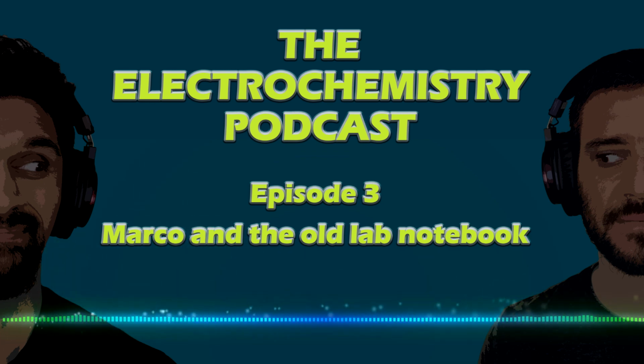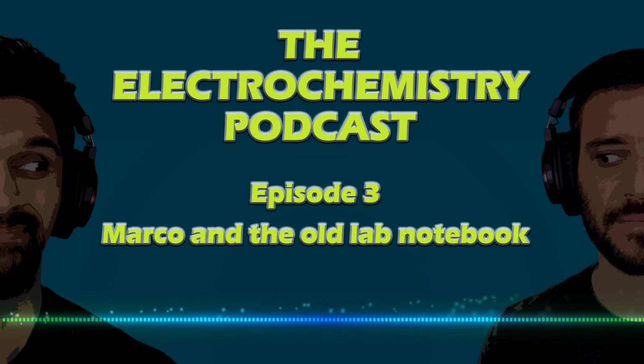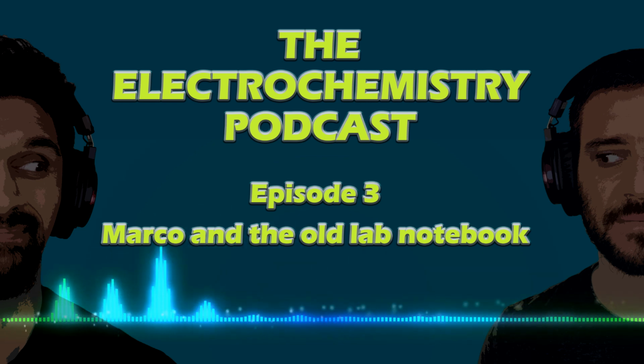Okay, so right away here, I think I see a problem. So you said Marco tried to apply down to minus 2 volts? Correct. Yeah, so that's going to be a problem. So you see, when you're doing electrochemistry, you need to be aware of constraints with your solvent. So first of all, if you're using water, like in an aqueous system like Marco here, you've got a window of maybe 1 to 2 volts total. It depends on the pH and the reference electrode and things like that, but something like minus 1 to plus 1 volts, something in that area. But generally speaking, if you're trying to apply minus 2 volts in water, it's probably a bad idea.